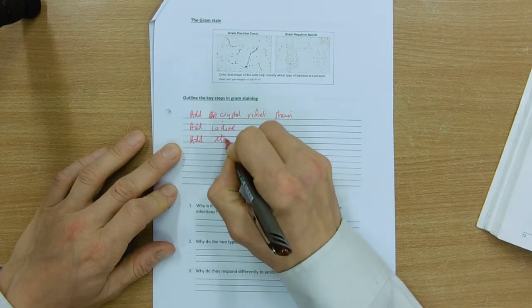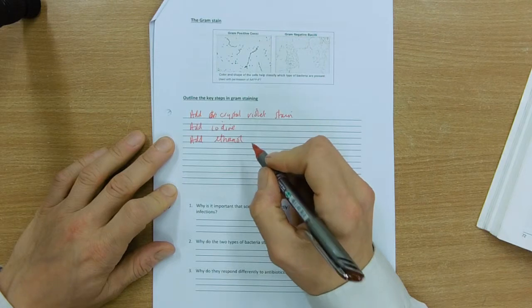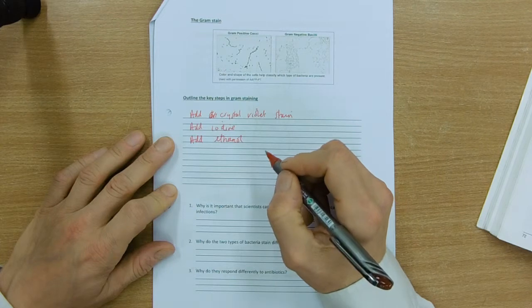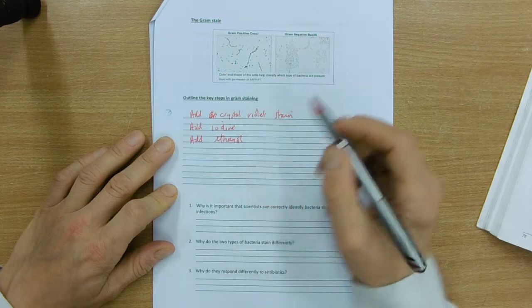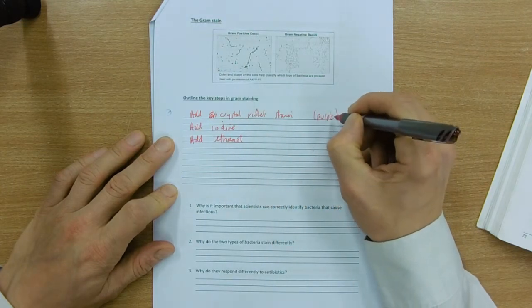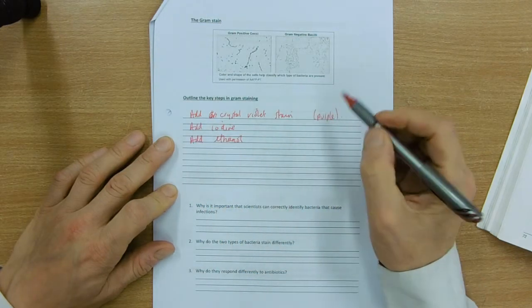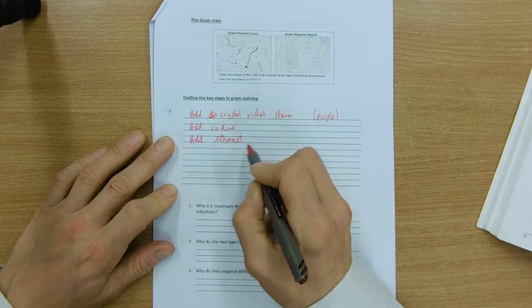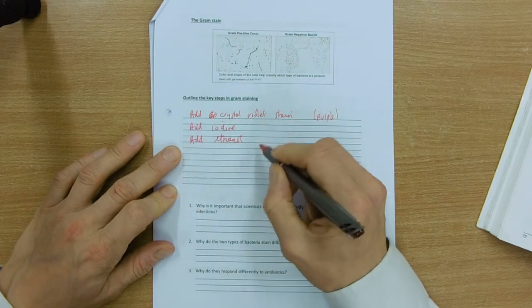So add ethanol, and then some of those bacteria lose their colour during that process, and some keep that kind of purple. So crystal violet, that's our kind of purple colour. And then after that we add another, so some stay purple, and then after this some of them essentially disappear, they don't keep their colour, and we add another stain called a counter stain to show us those.